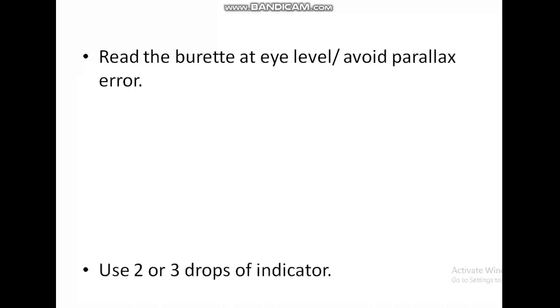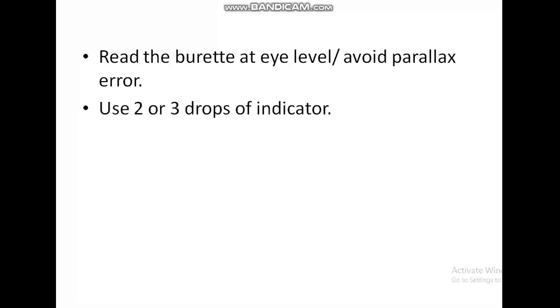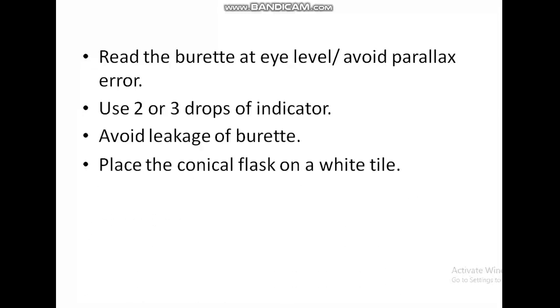Use 2 or 3 drops of indicator. Avoid leakage of burette. Place the conical flask on a white tile or paper.